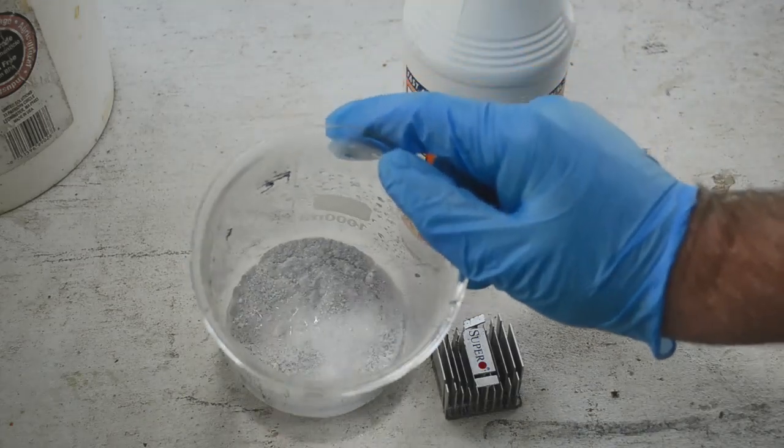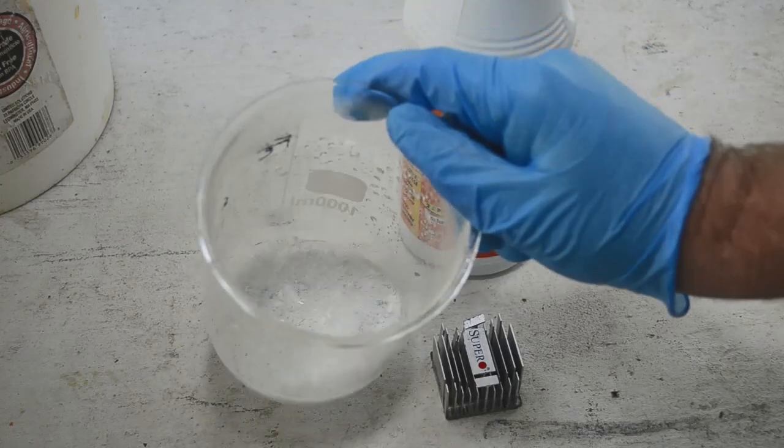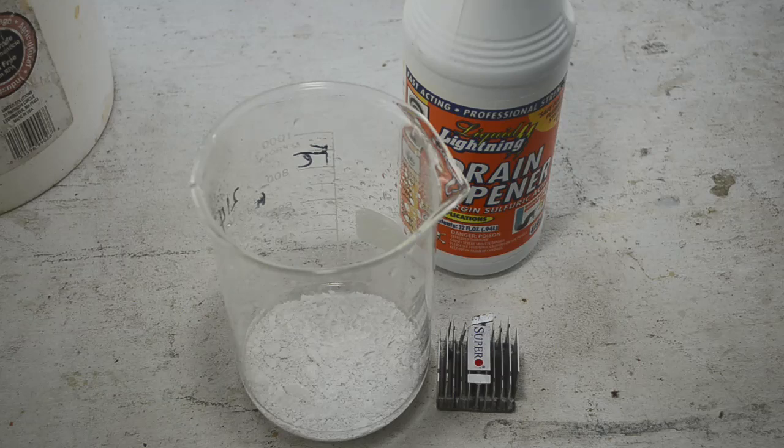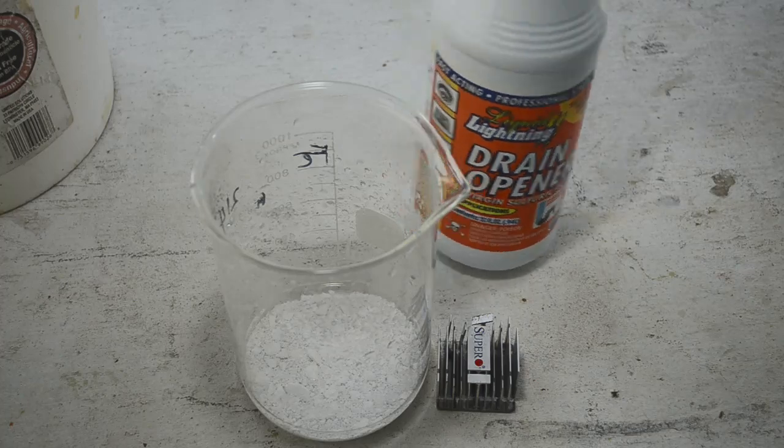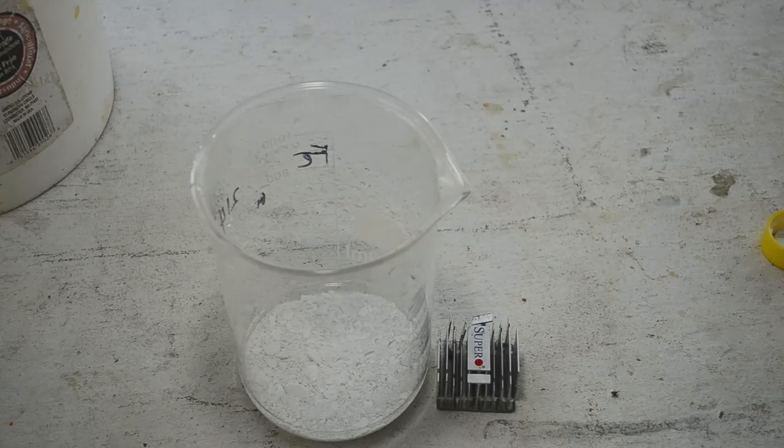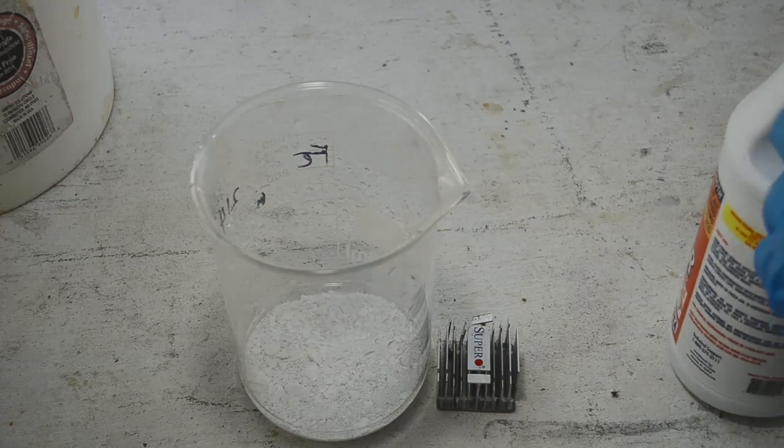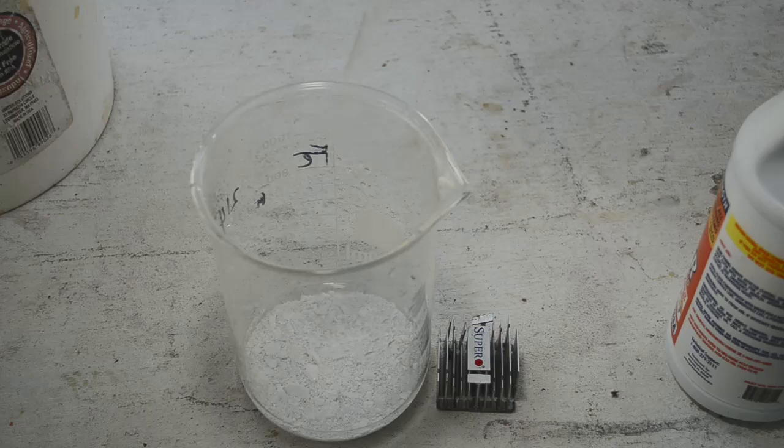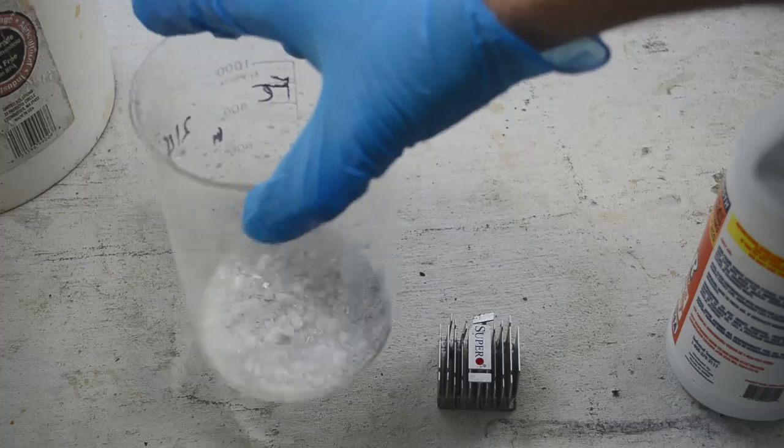So I've got some more silver chloride down here in this beaker, covered with just a little bit of water, maybe a millimeter or so over the top. That's all that's in there, nothing else. Now I'm going to add a few drops of sulfuric acid drain cleaner to this, not a lot. Just a little bit. One, two, three, four, five, six, seven, eight drops. That's all.